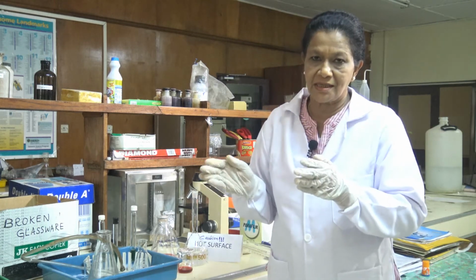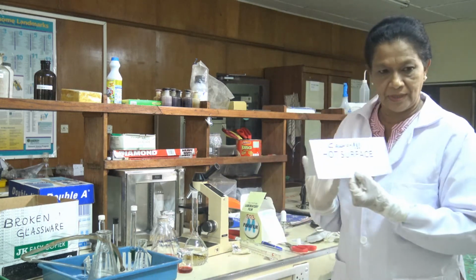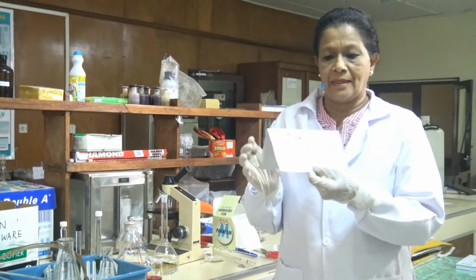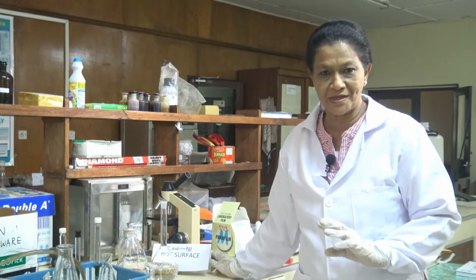When working with hot glassware, which looks the same as cool glassware, special care should be taken to place it where no one can accidentally get into contact with it, or you can place a label like this near the hot glass vessel.